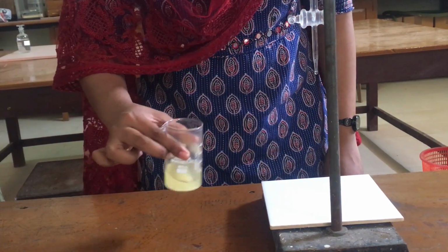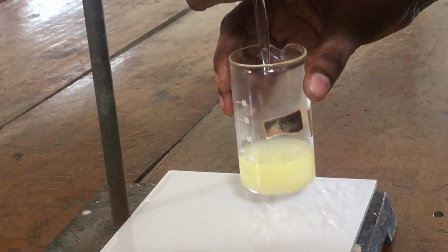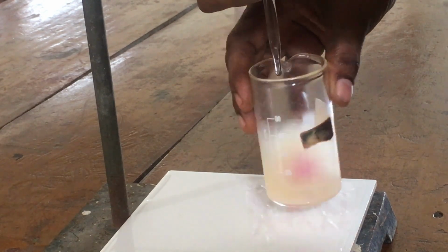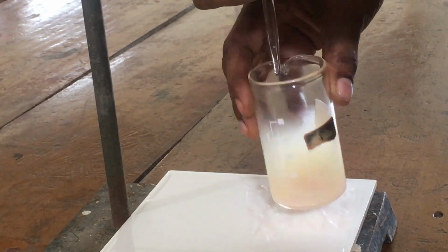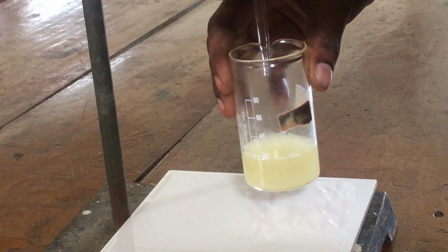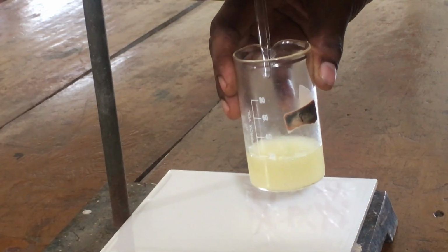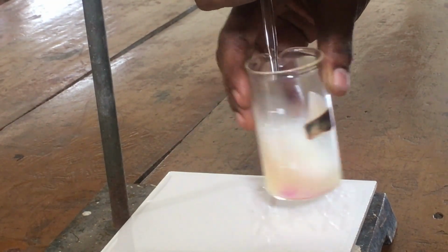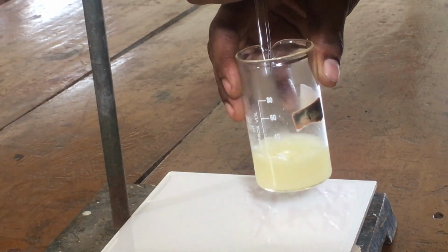We are going to titrate the melted fresh butter against 0.1 normal KOH, and we should be very careful to add only drop by drop because the result will not be a big number.